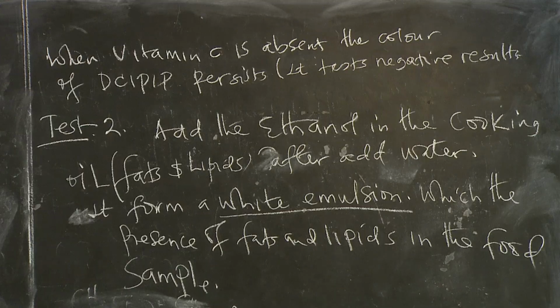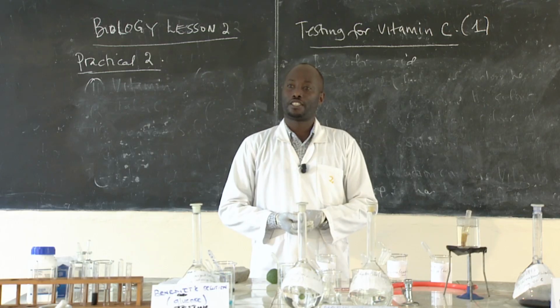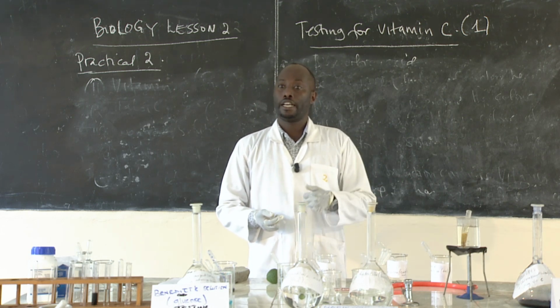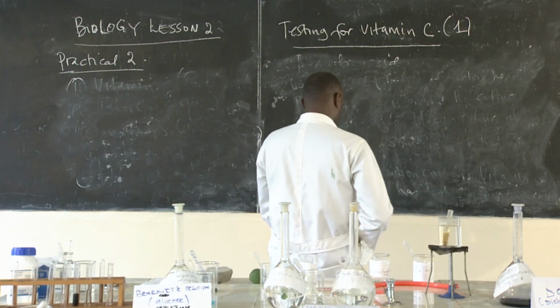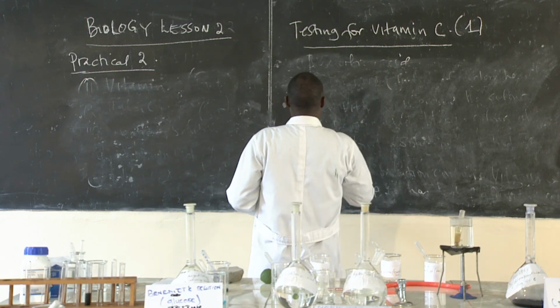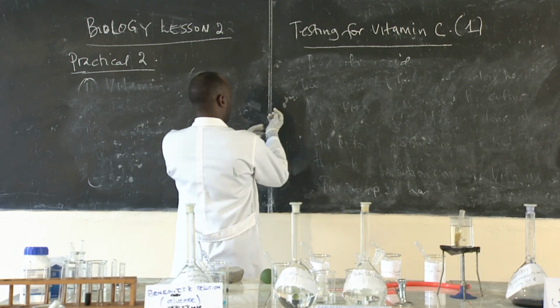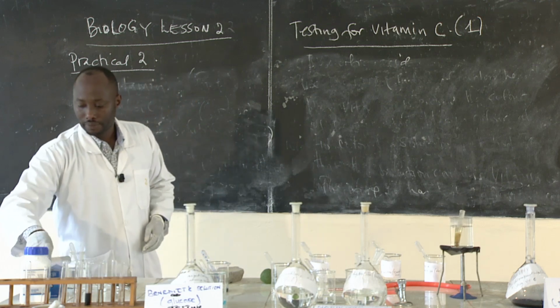Students, thank you. I think the lesson was very enjoyable because it involves food nutrients. It involves very many things that we use in our life, because we have to test these food nutrients and know their major constituent by using these chemical compounds. Let us do an exercise.